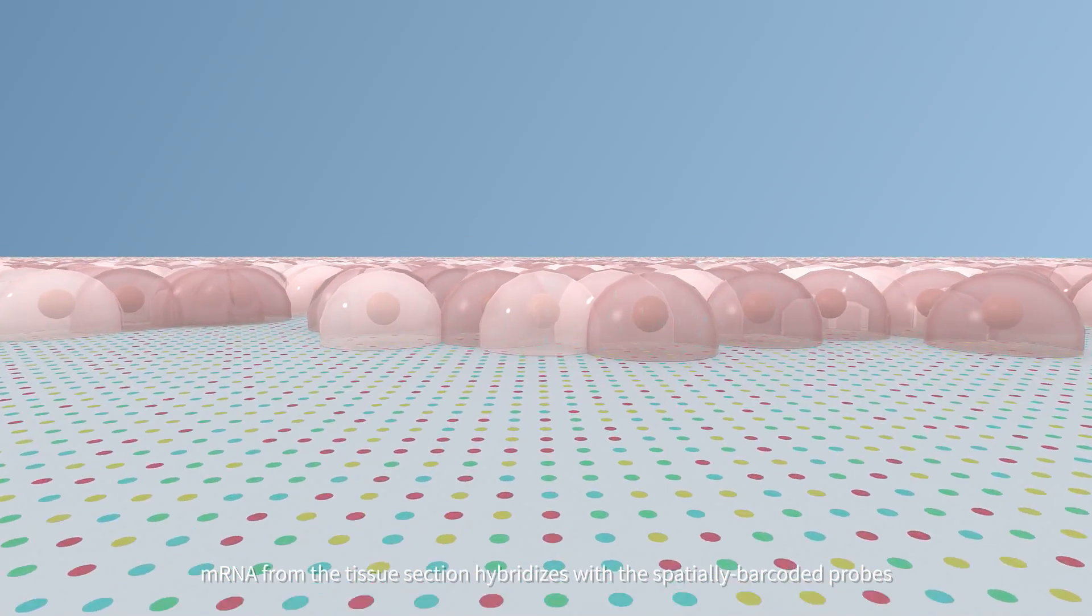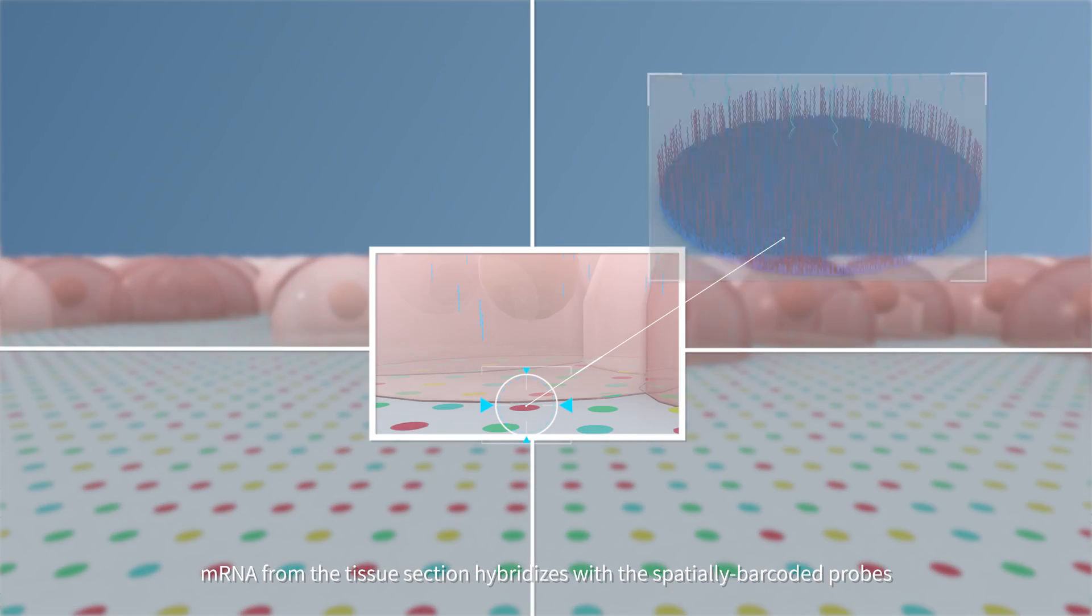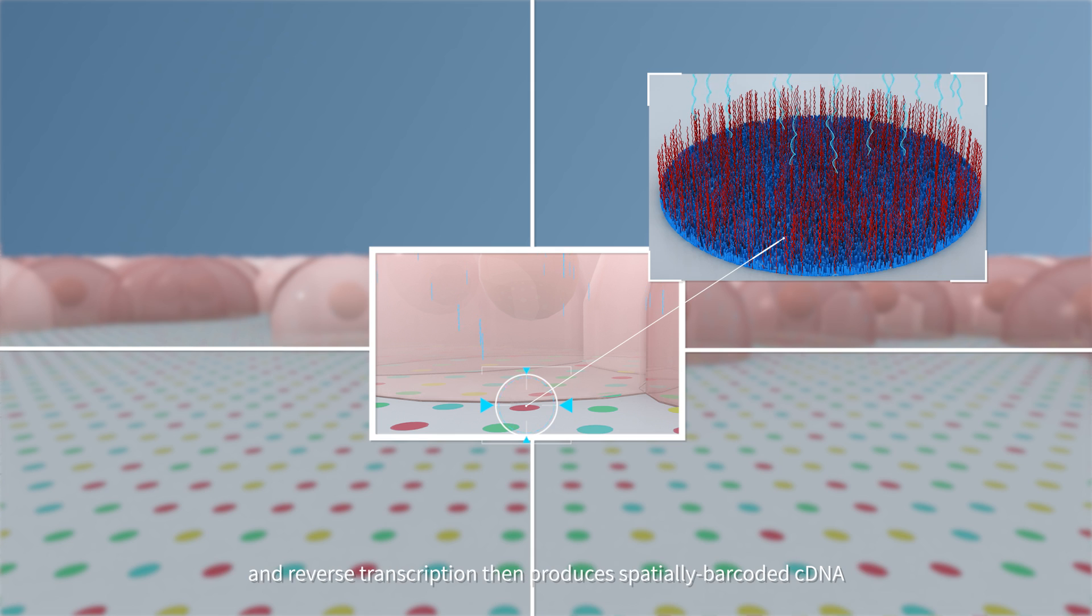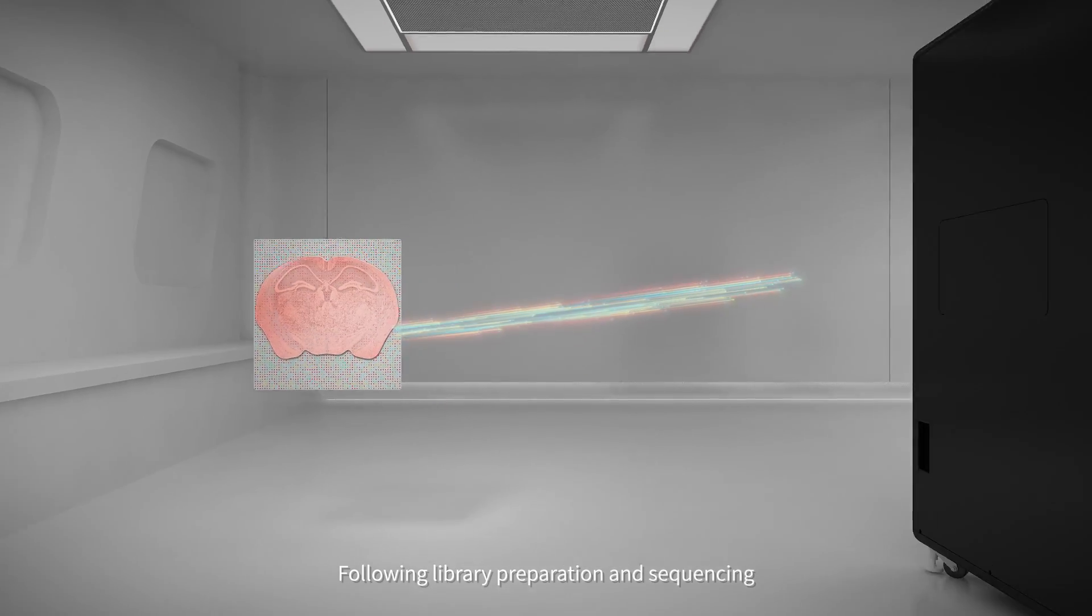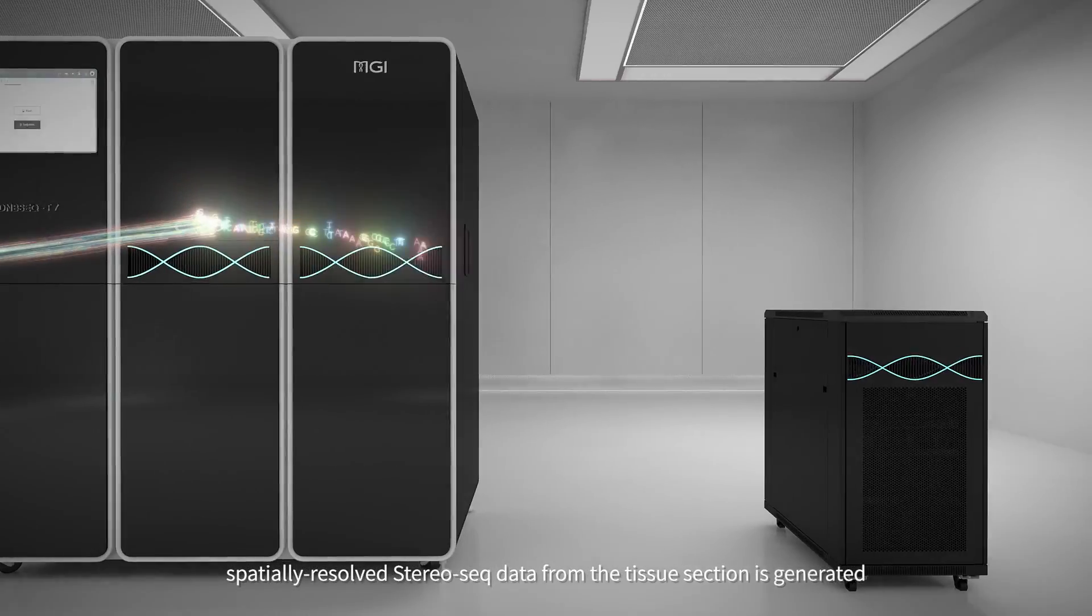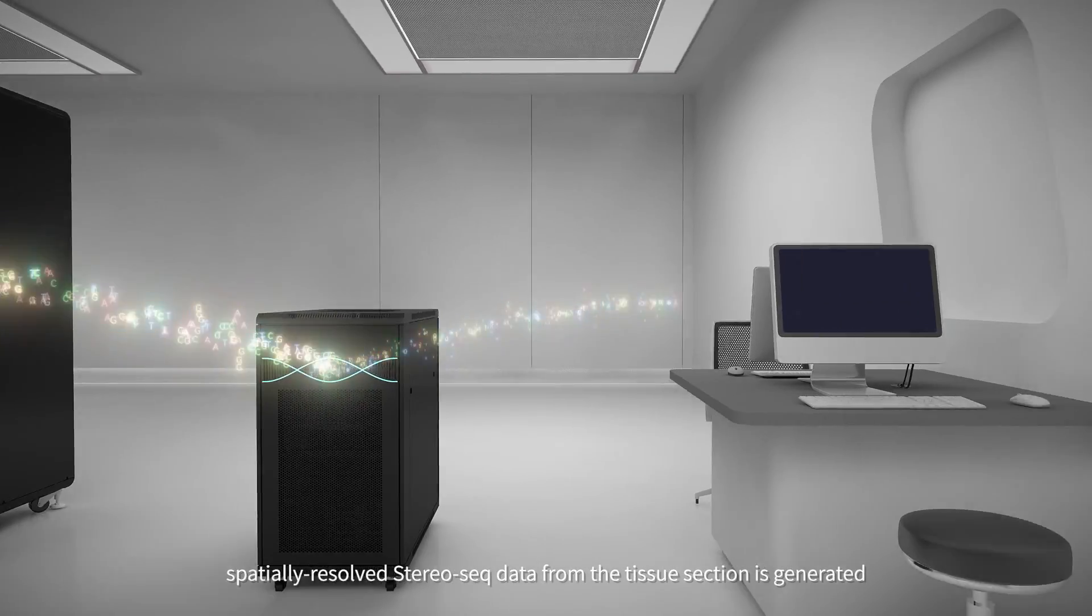mRNA from the tissue section hybridizes with the spatially barcoded probes, and reverse transcription then produces spatially barcoded cDNA. Following library preparation and sequencing, spatially resolved Stereo-seq data from the tissue section is generated.